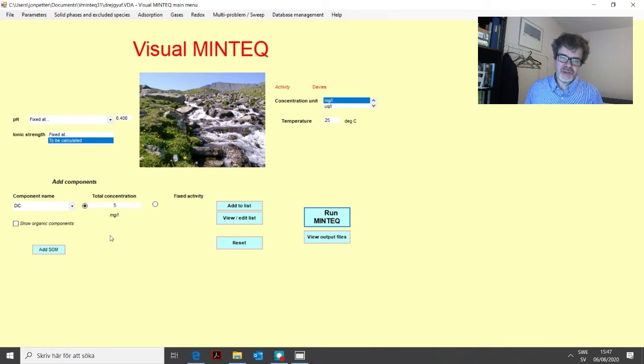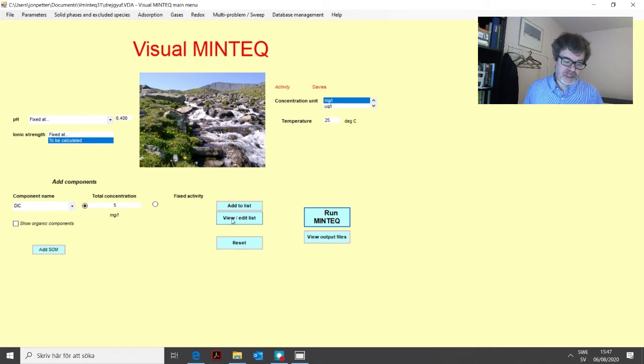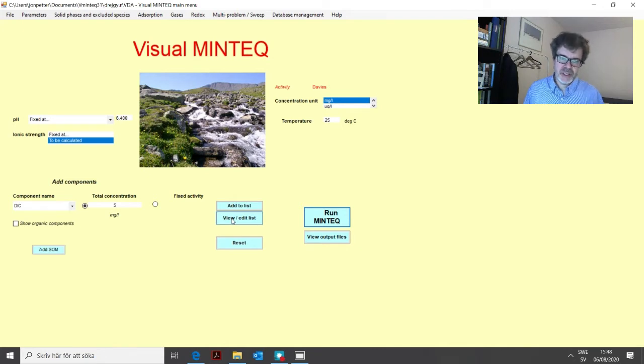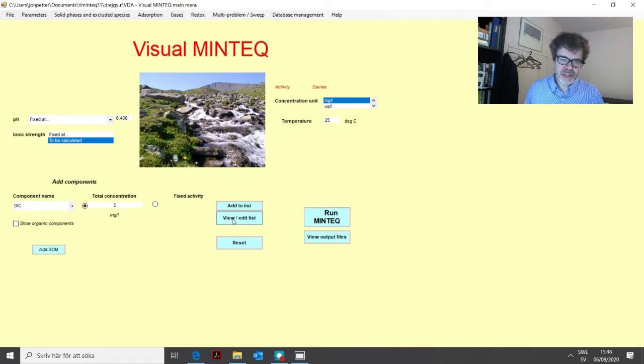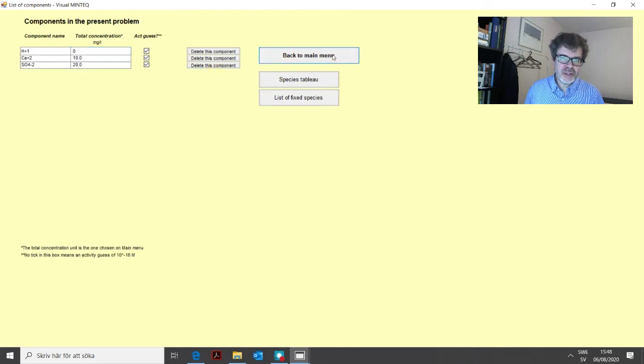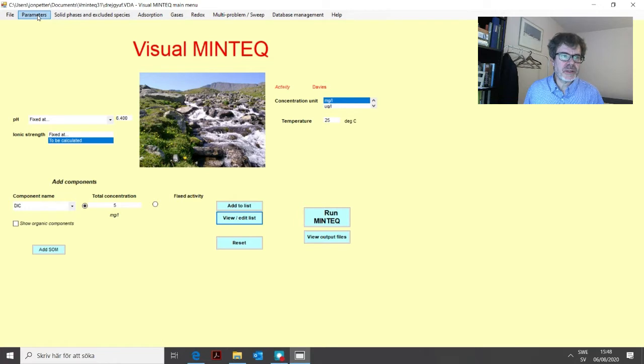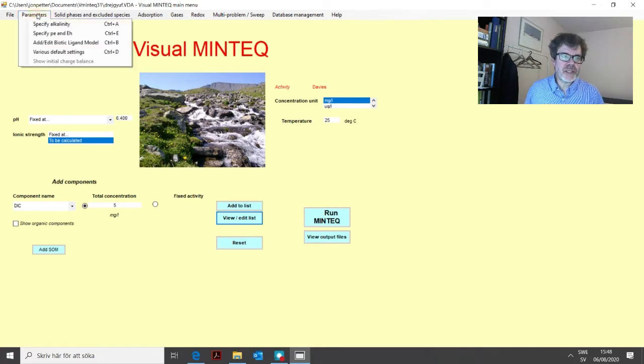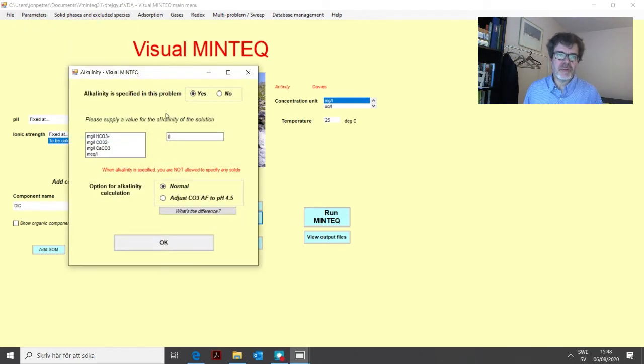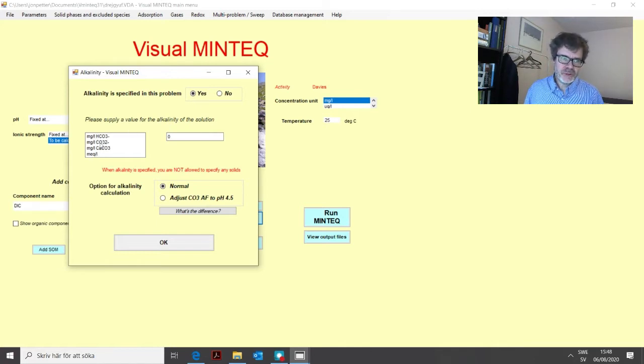Another one is if we have a measurement of alkalinity, which is mainly different carbonate forms and mainly bicarbonate. So before we do that, we need to get rid of this DIC component. And then we enter a new menu, which we can find up here under parameters. And the specify alkalinity option will take us to a new menu where you specify alkalinity.